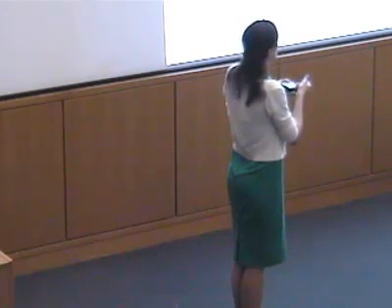So this is now a Fourier transform of our EXAFS, and the way to think about this is if this is the absorbing atom here at point 0, then this Fourier transform means that around 2 angstroms, there's a whole lot of stuff backscattering. Okay? So this would indicate I have some ligands at about 2 angstroms. Be careful, you can't read the distance directly off a Fourier transform, just like protein crystallographers or anyone doing any scattering-based method. We also have a problem with knowing what our phase shift is. As a rough rule of thumb, you can add about 0.3 to 0.4 angstroms to what you see experimentally, and you'll have a good guess of your starting distance.